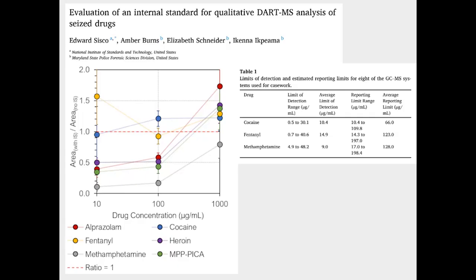And what we decided to do was to tie it in with our data integrity. So we previously had measured the background levels of drugs in our laboratory, and we had looked at what those levels would look like on the GCMS if we were to concentrate all the background that we had into one sample and ran it on the GCMS.